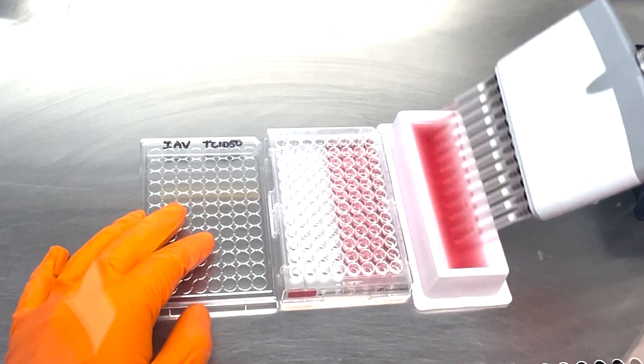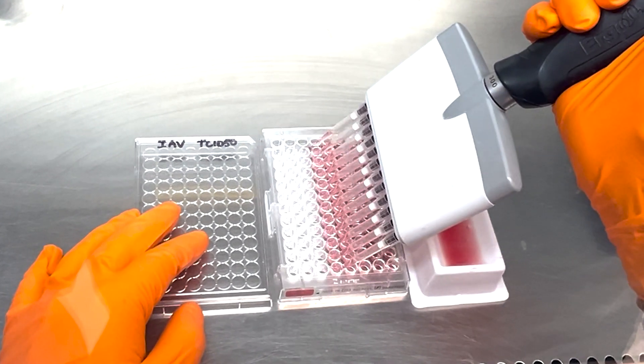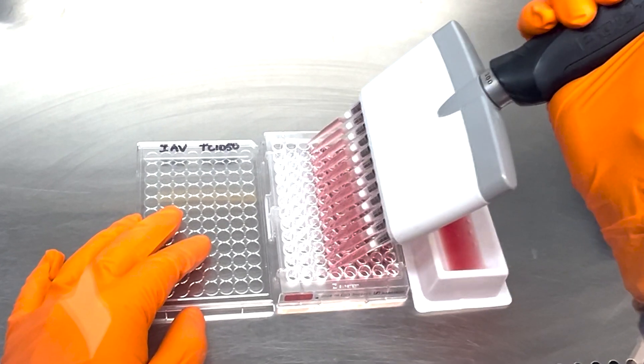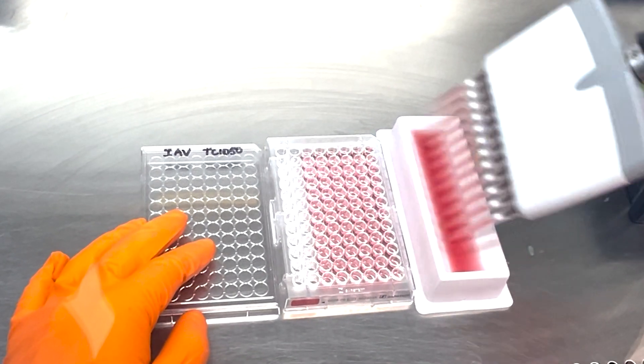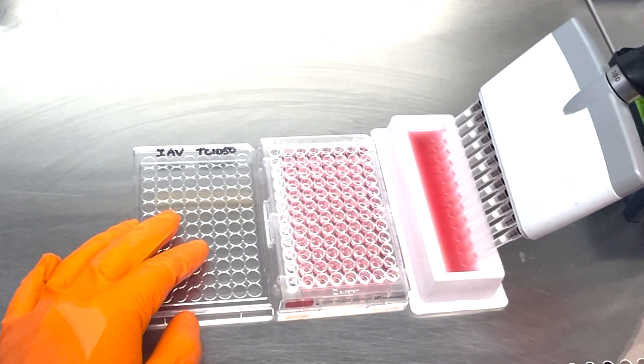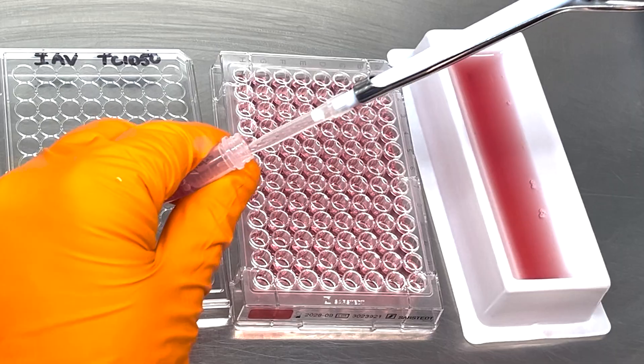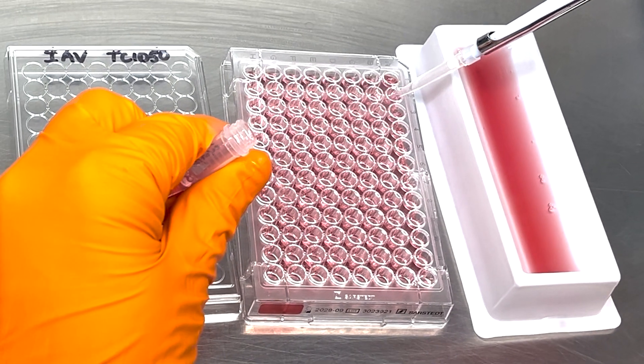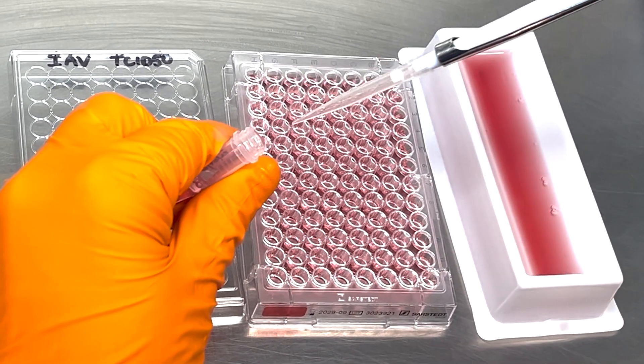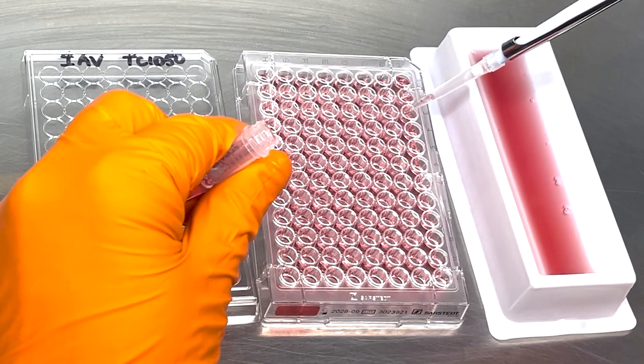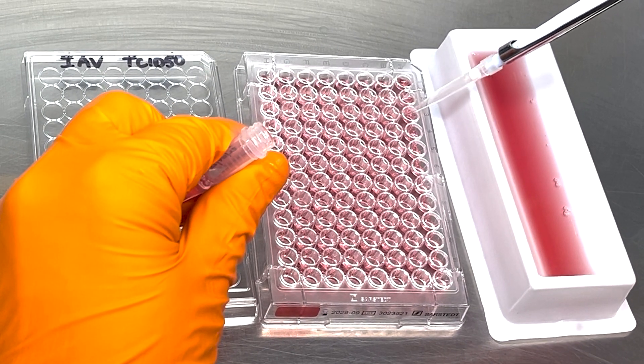First, we need to prepare the virus dilutions on a 96-well plate. We start by adding media to each well. Then, we add the virus to multiple wells in the top row of the plate to create replicates, which is crucial for achieving reliable and reproducible results in our analysis.